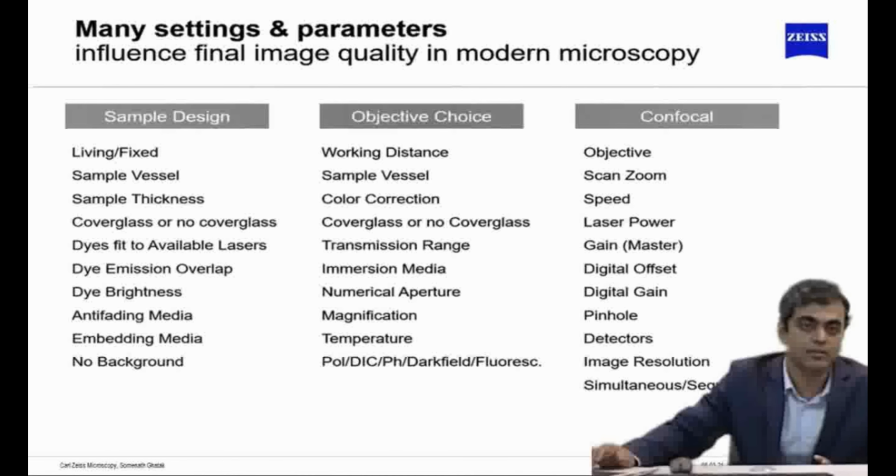So all these glass vessels are allowed. The thickness, if you are going for 60x or even 40x and above, should be less than 1 mm. The cover slip or the glass slide you're using should be of 1.5 grade, so there are no diffractions within the glass slide.